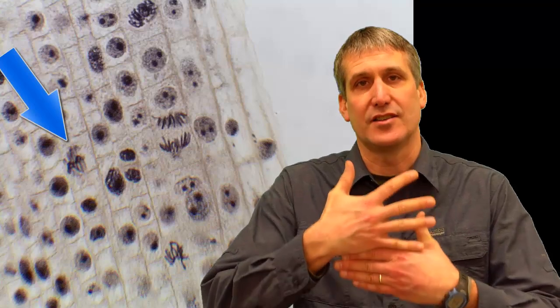Is that cell in metaphase where I can tell that the chromosomes have lined up at the center or equator of the cell? Or is that cell in anaphase where I can see that the two groups of chromosomes are being pulled to opposite ends of the cell?